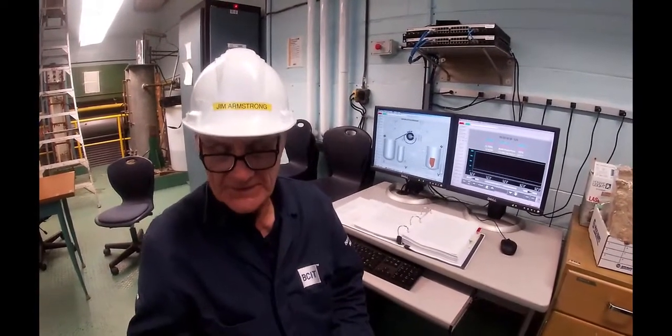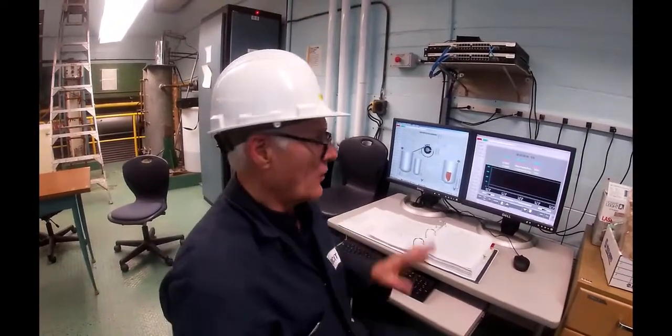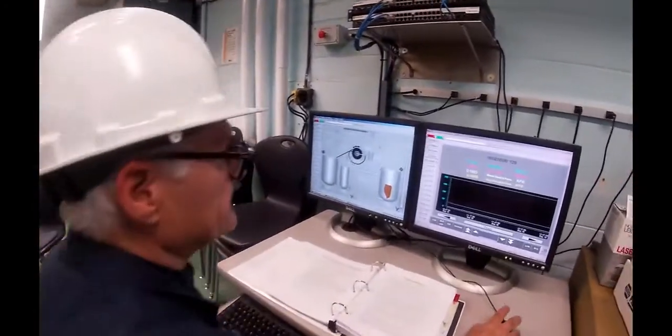Okay, we're ready to start our brown stock washing. A few moments ago, we actually pulled some consistency samples from the number 3 unwashed stock tank. We also took some of the liquor out of there with no fiber in it, and we're testing for the dissolved solids that are in there to start with. So we'll have it before the wash and after the wash, so we can figure out how efficient this little washer is.